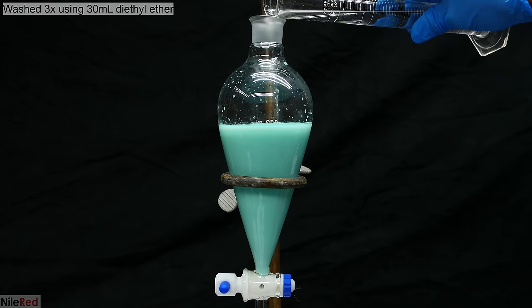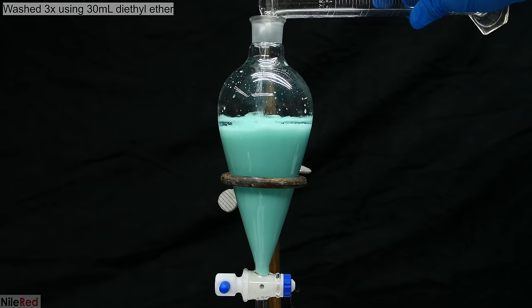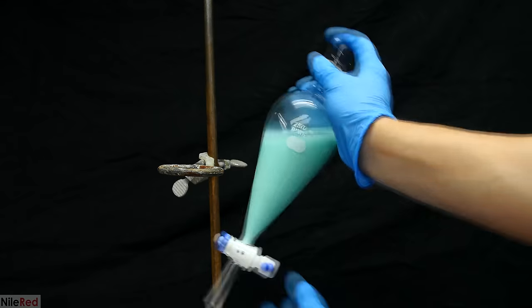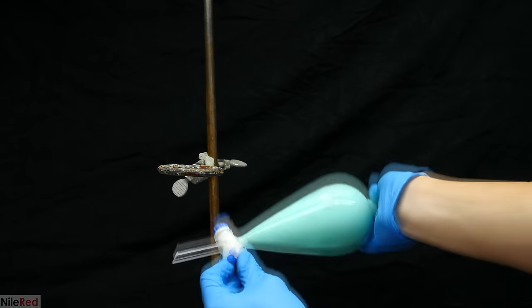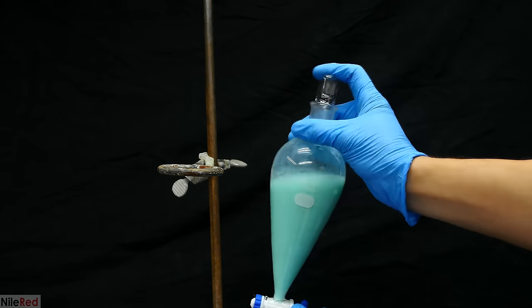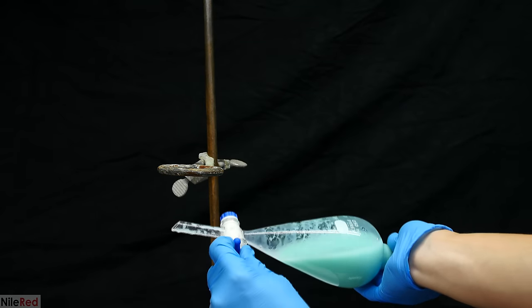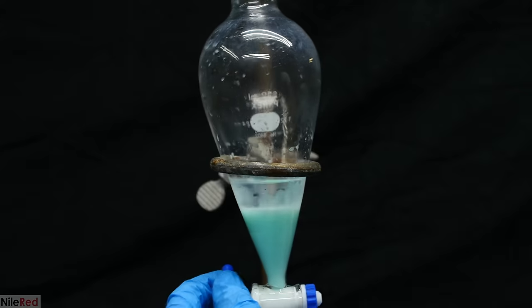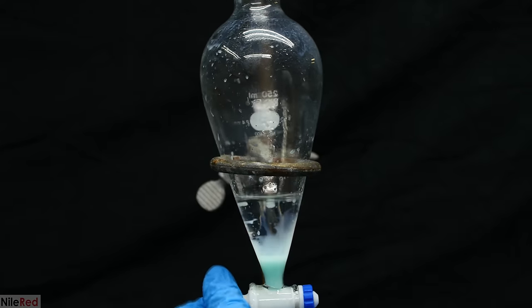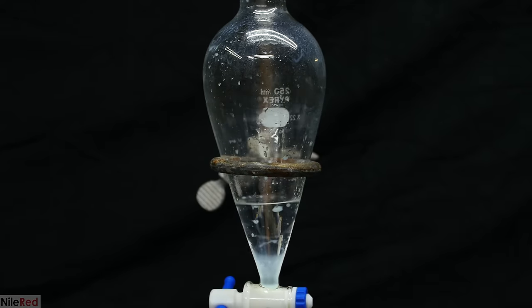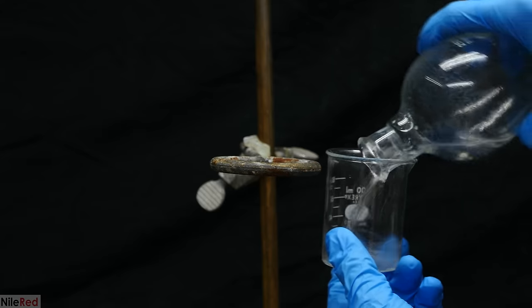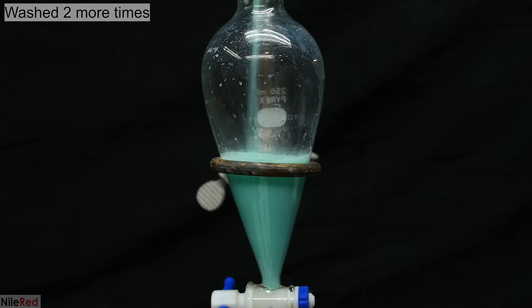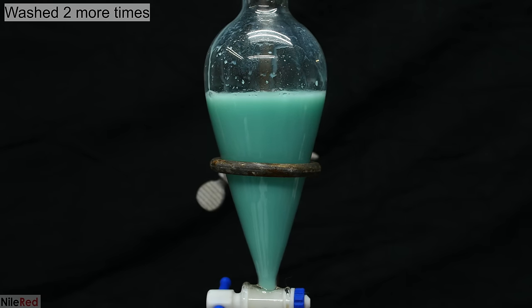The cadaverine solution was extracted three times using 30 milliliters of diethyl ether each time. The typical procedure is that we add the extraction solvent, we cap, shake, and vent the separatory funnel, and then we place it back on the stand for the layers to separate. Once the layers have separated, the lower aqueous layer is drained off, and we collect the upper ether layer in a beaker. This process is repeated two more times for a total of three washings.